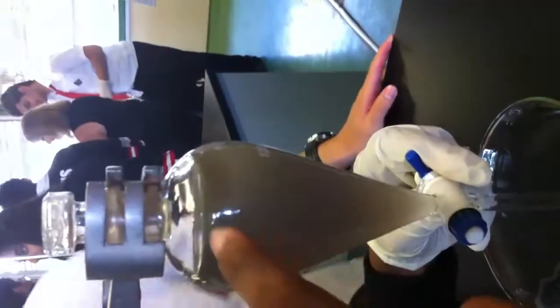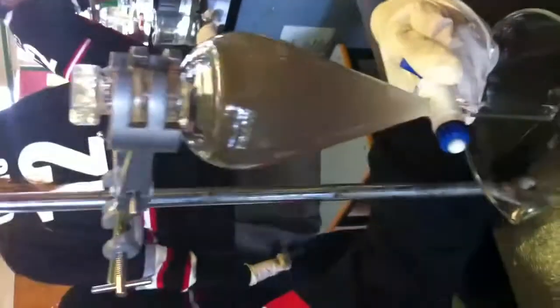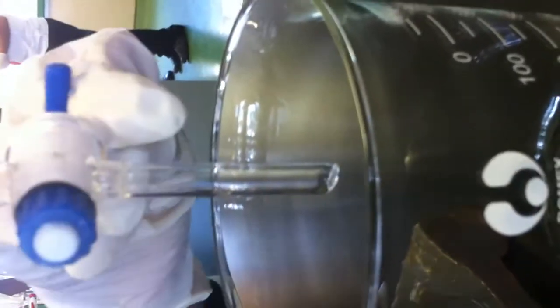Kim, where do we take the water out to, about where? Right now. So you put water in your crap, right? Yep. Open it. To about where? Here. Oh, okay. So we have to open it so it stops to here. This is a line. See there? Because yeah, there's a darker line. So that's where we have to stop it at. So we have to let it drop. That's pretty dodgy. It is. What line? It's not a definite line. No, wait. Yeah, okay, stop.